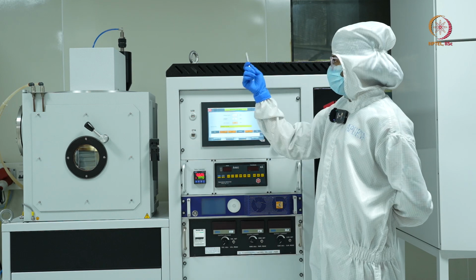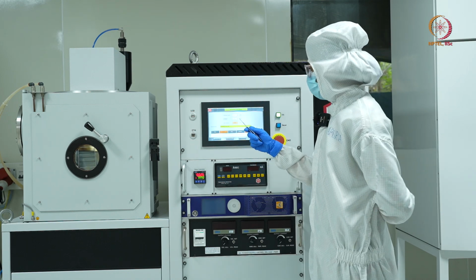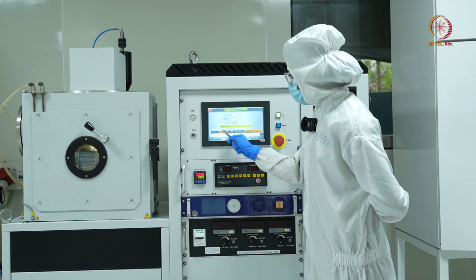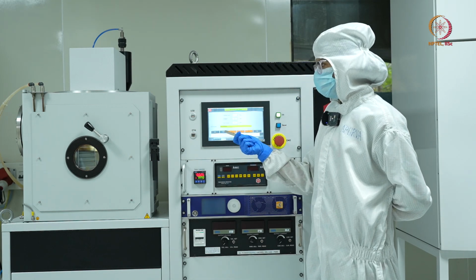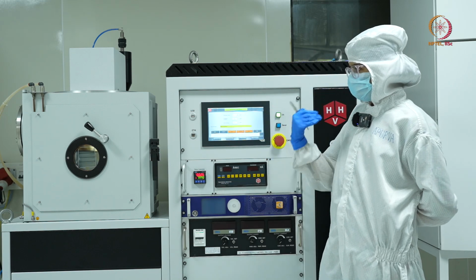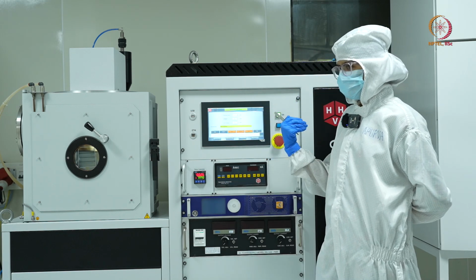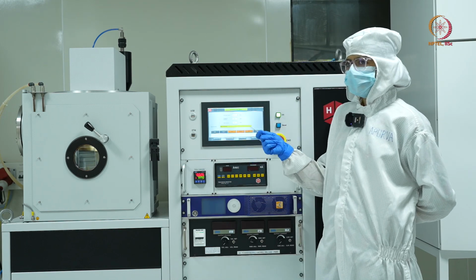So the valves have come back to their normal position, and then I'll press cycle. What cycle will do, whatever argon was present inside the chamber, all the argon will come out, and we'll keep it cycling for a few minutes and then we'll vent.